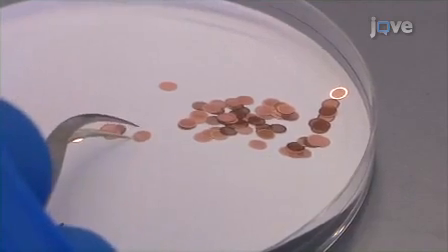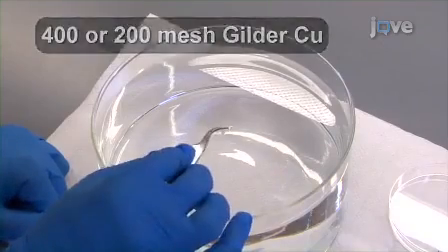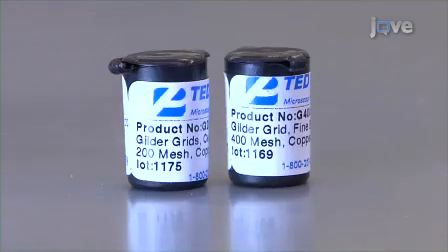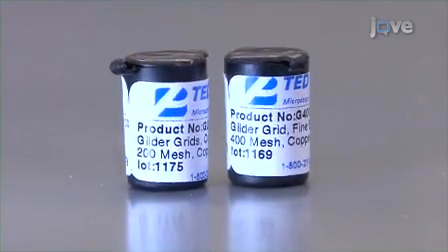Next, place between 50 and 100 EM grids one by one onto the floating plastic film, shiny side down. Select 400 mesh grids for routine negative stain, and select 200 mesh grids for collecting tilt pair images.